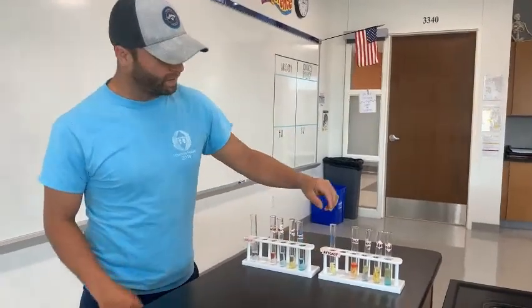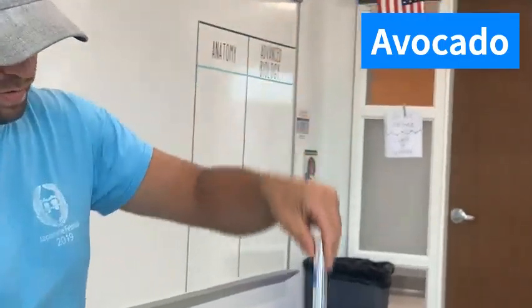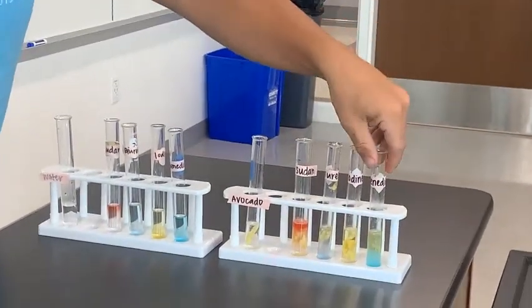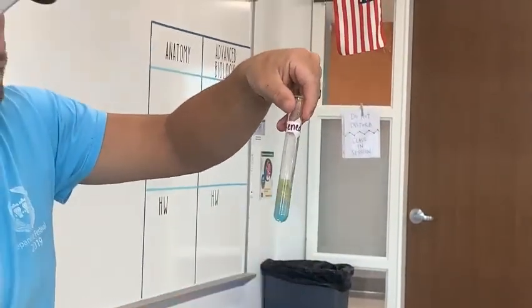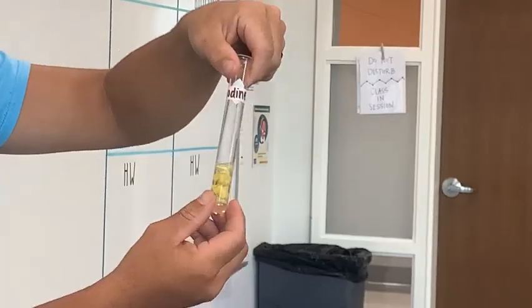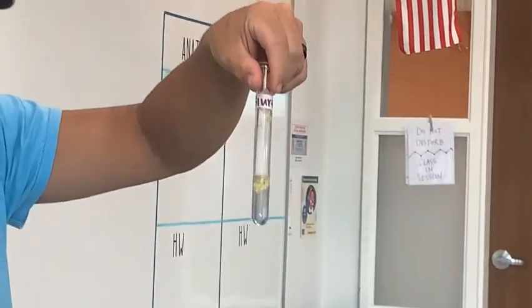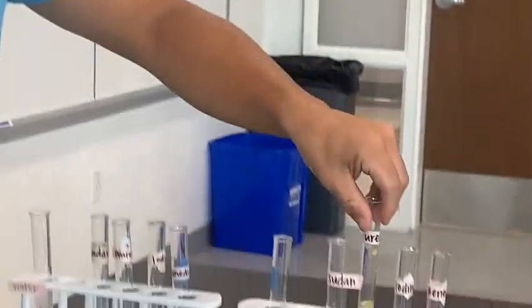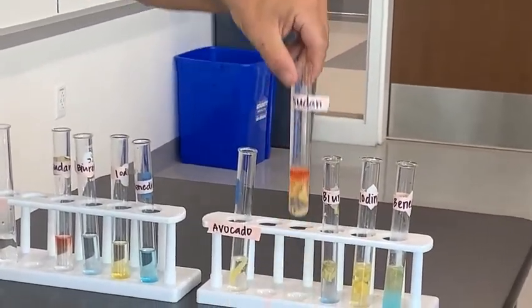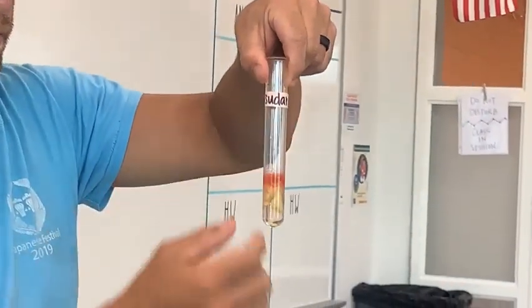Next on my sandwich was avocado — cut up and put in a little bit of water. With Benedict's solution, you can still see the blue color. With iodine, still a yellowish color — no change. With the Biuret test, still a bluish color. And then with the Sudan test, there is a pretty dark colored red ring, indicating the presence of lipids.